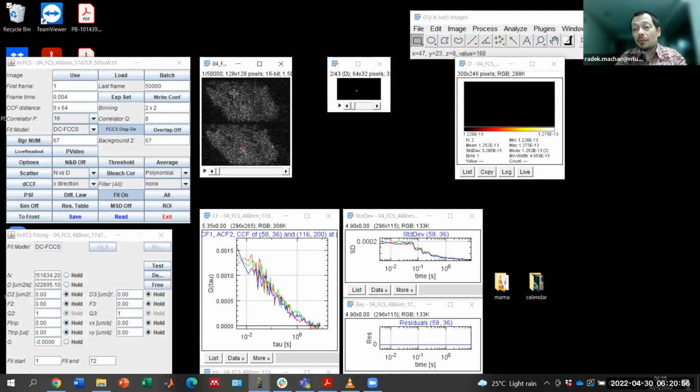So there might be some pixels which will not have any usable correlation. And you see what happened because I correlated here outside of the cell in a pixel where there was no correlation. Then it affected the parameters of the fit, and now you see the fit failed.